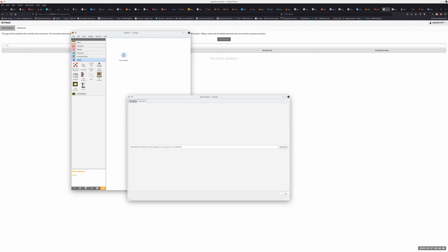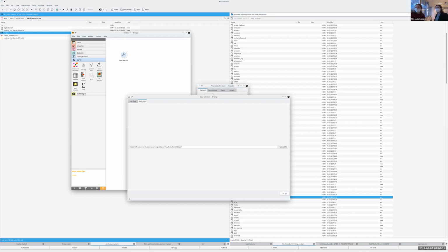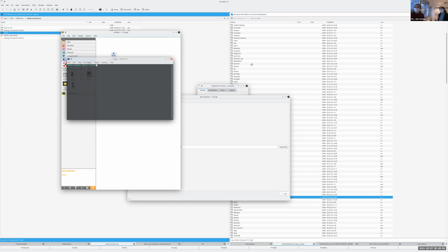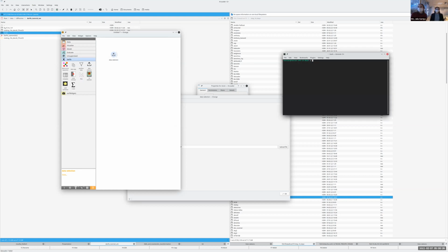Well, what do you see now? We see that you don't have the tab. Did you open Orange via the terminal? Yes. If you can go back to the terminal, I see that you missed some widgets. So maybe there's a problem in there, maybe some packaging stuff. Go back to the terminal where you started Orange, so we can close it.